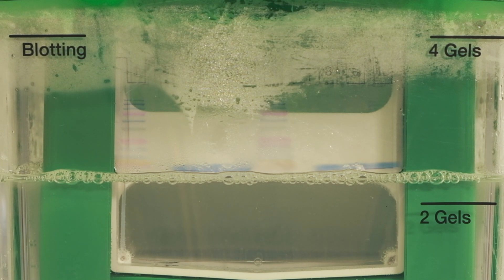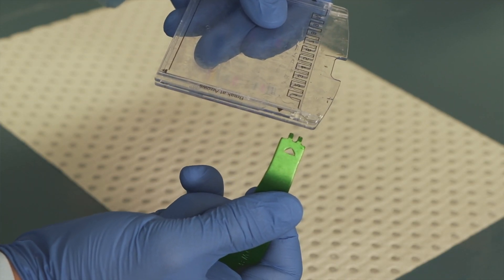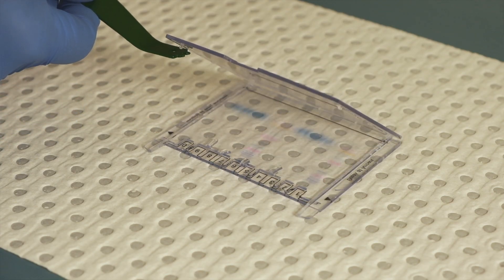Once the gel has finished running, release it from its plastic casing. Using a separator, lever the plastic casing apart. This can require a little more force than what is typically used for these protocols. Peel off the casing and place the gel in a tray for further processing.